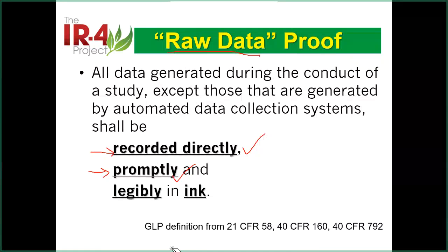Don't wait longer than a day, otherwise that's a finding. But if you have a typo or something wrong, you can correct it days later. That's okay because you always make mistakes, and later when you read it again, you find them. That's fine. So it should be prompt and in permanent ink.